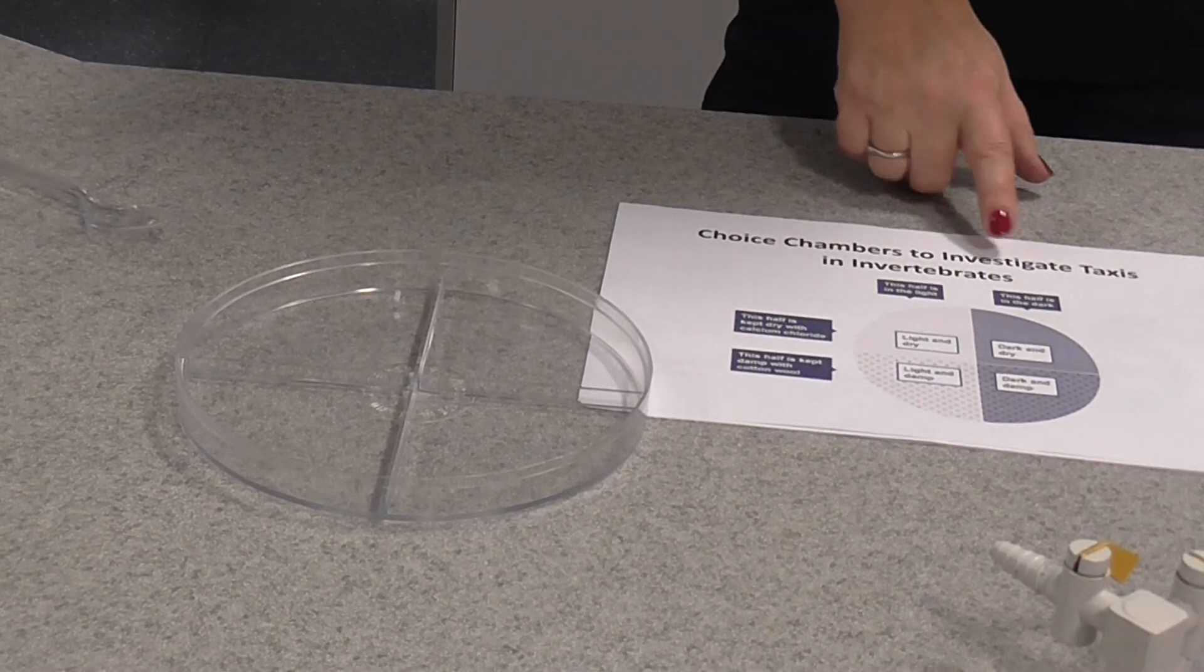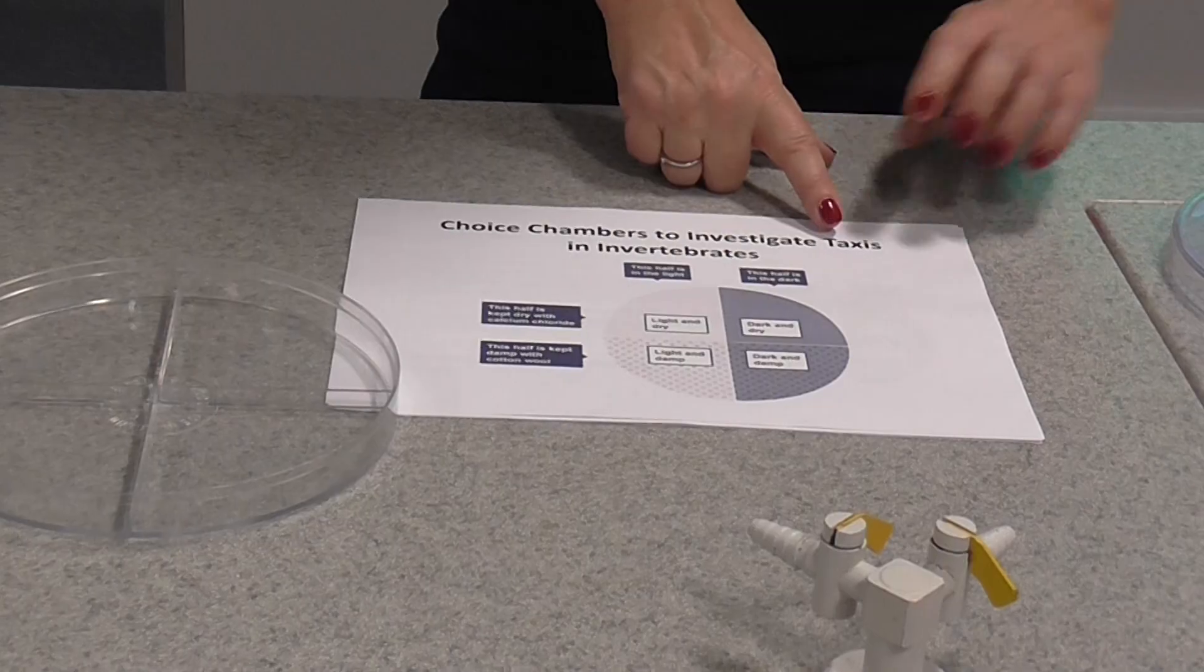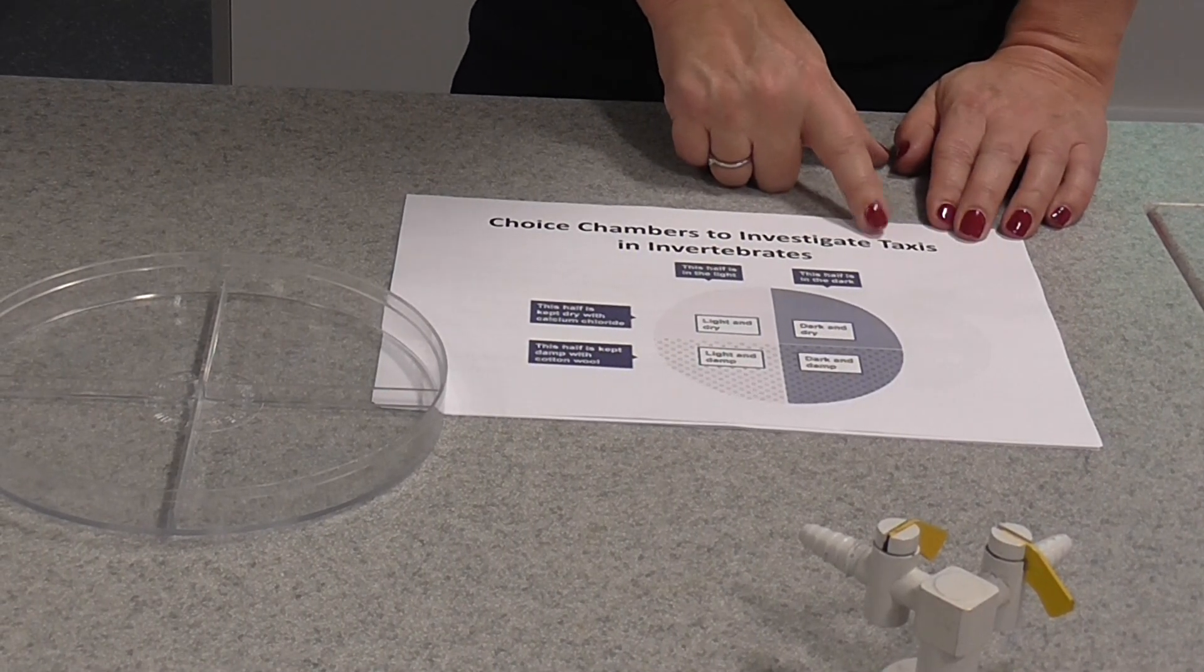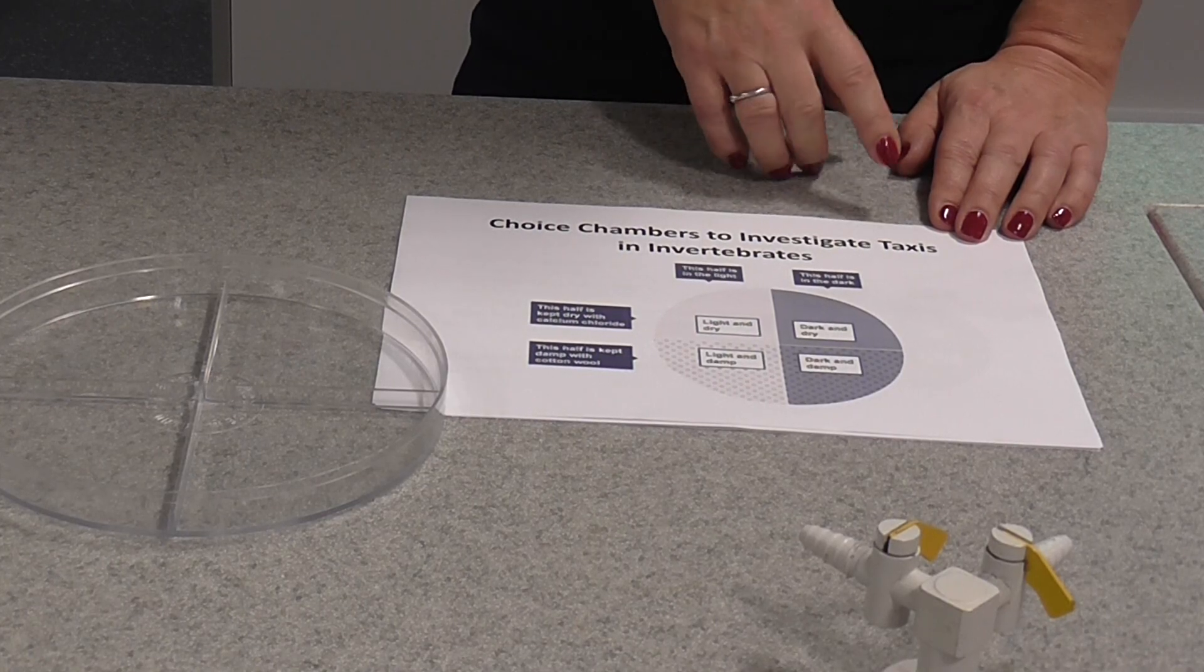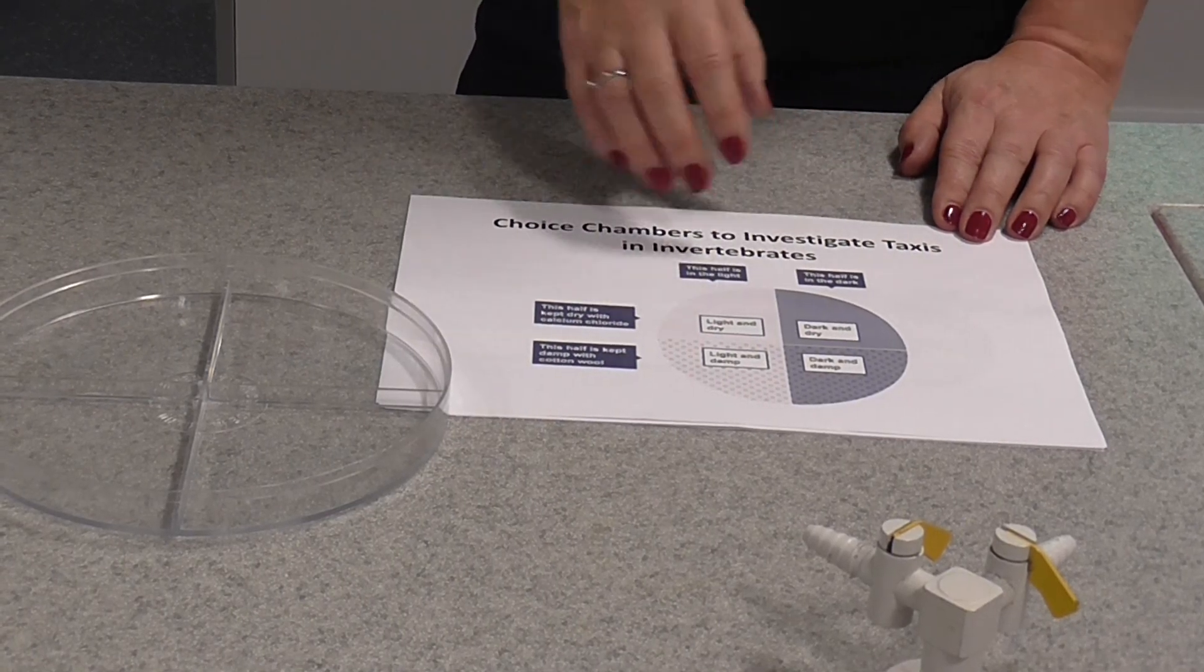Can I remind you that what we're investigating here, taxis, is a simple animal response where the direction of the response is related to the direction of the stimulus. So they're moving towards or away from different stimuli.